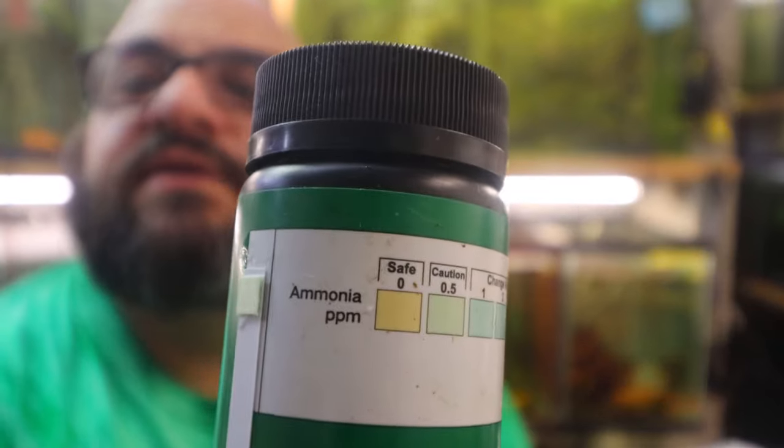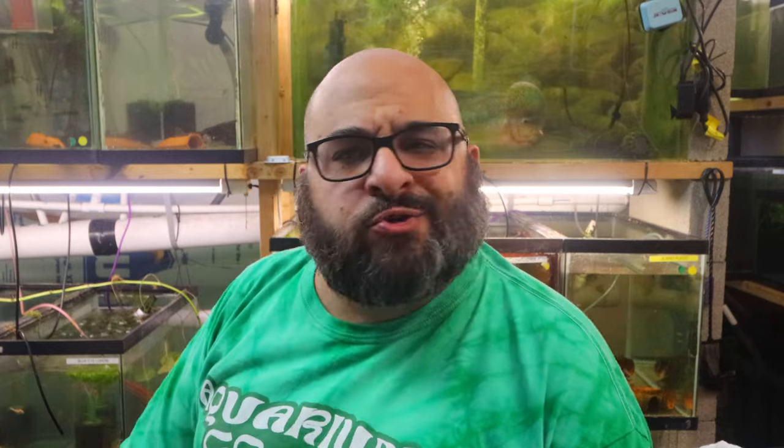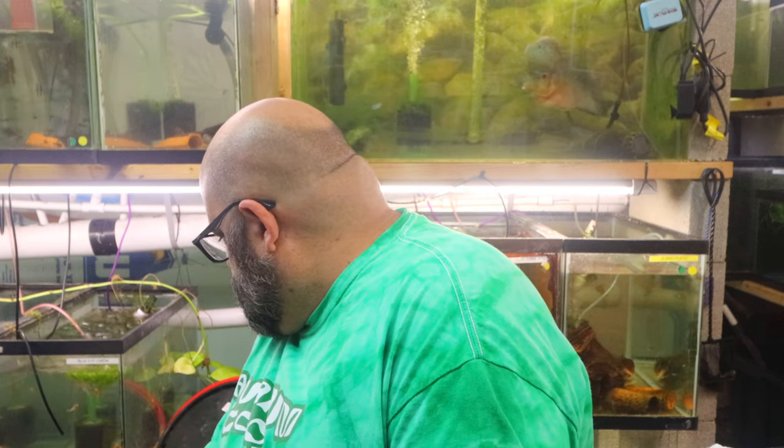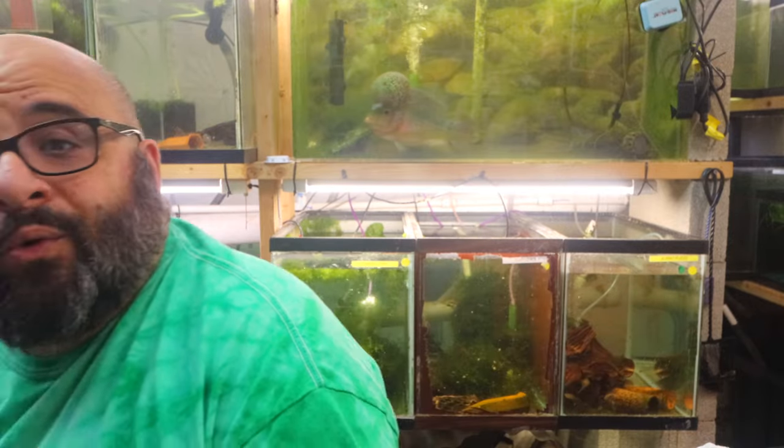There's our result. Holding it up against the chart, it looks like I have a little ammonia in that tank. What should I do? I could use Fritz Complete, do a water change, or do nothing — which is what I'm going to do, because the beneficial bacteria will catch up. Actually, adding some Fritz Complete for a couple of days is probably the best way to go — in fact, that's what I'll do when I'm done, if I remember.